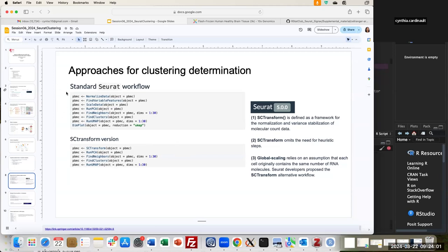The standard Seurat workflow requires these steps: first, normalize the data; then find variable features; then scale the data to a log-normalized value. In the SCTransform version, normalization and scaling are embedded within the function, so you can skip those steps and continue with the same downstream workflow.